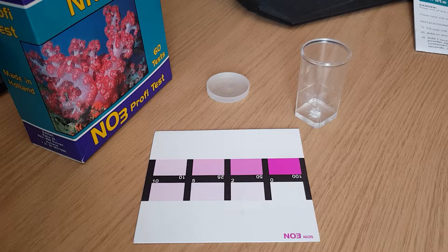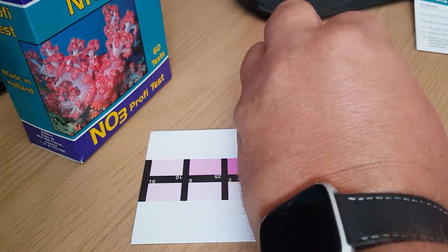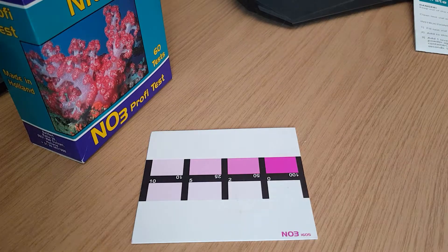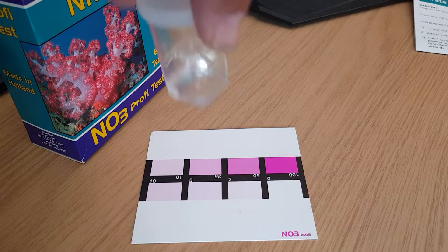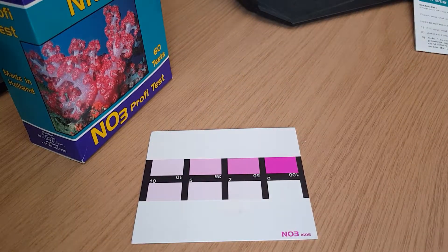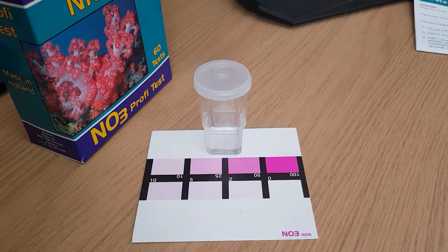It says to swill, not shake. So put the lid on and swill it around until it's nicely dissolved, then leave it for three minutes. I'll be coming back to that in three minutes.